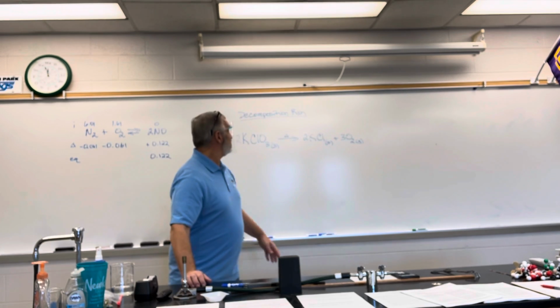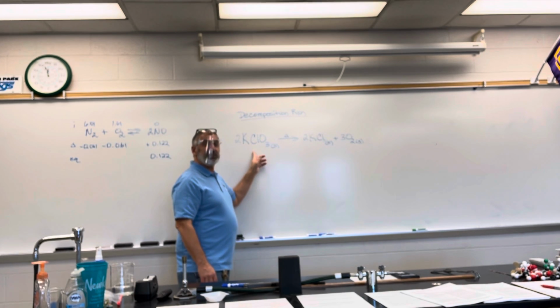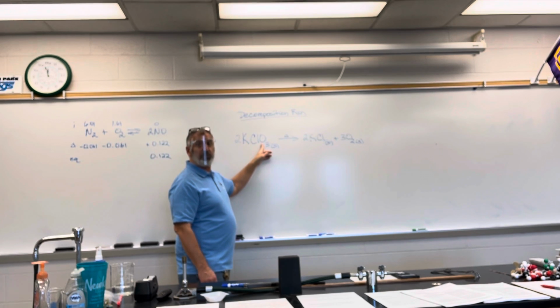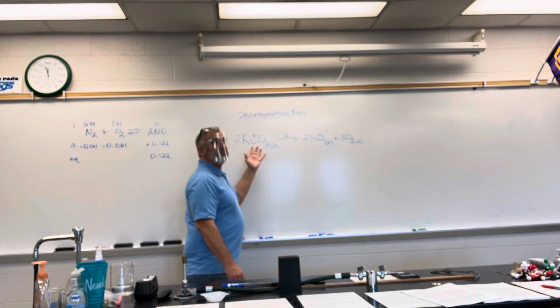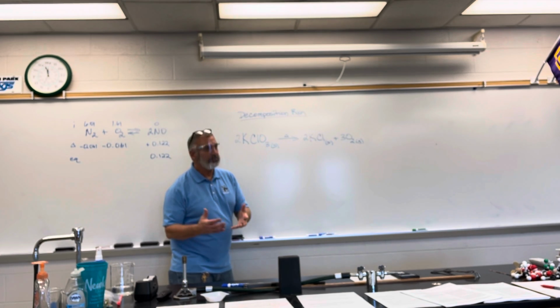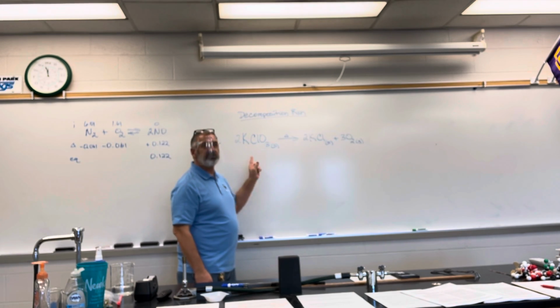So we're going to just put the KClO3, about 2 grams. Now, what does the law of definite composition say? Will the percentage of oxygen change if you use 1 gram, 2 grams, or 3 grams? No. It's going to be the same percent, right? The ratio of grams of oxygen to the whole thing is always going to be the same, law of definite composition. So 2 grams is just a good workable amount to get into the crucible. If you get 1.95 or 2.05, we're just getting about 2. Just make sure you're recording the exact mass.